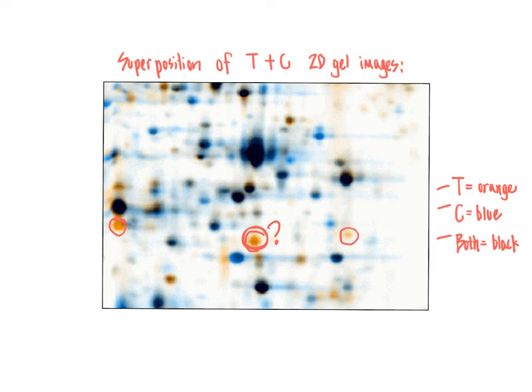Well, from the gel alone, all we can tell is the approximate pI value and the approximate molecular weight. And since if we think about a given cell, there are lots and lots of proteins of a particular molecular weight and a particular expected pI value within a cell, this 2D gel alone is not going to give us the identity of the protein.